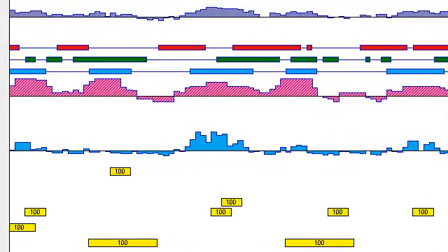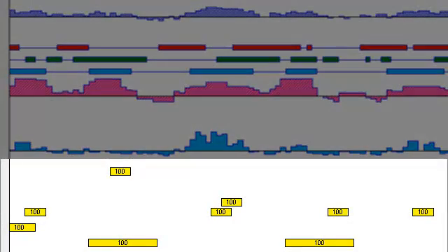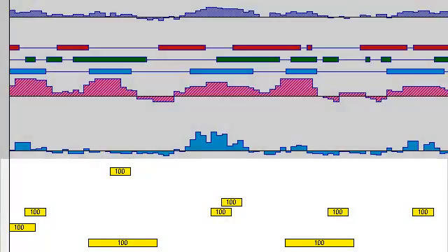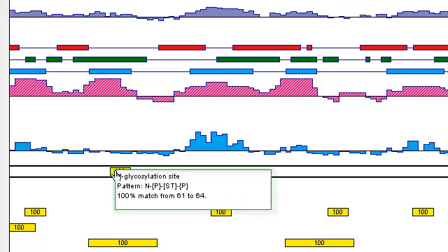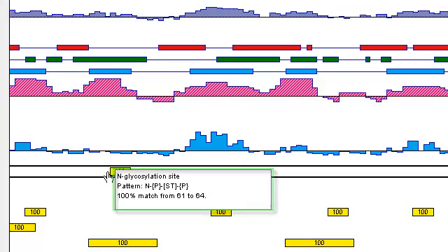You'll notice that there's a number displayed on each match, and this represents the match percentage. Clicking and holding on a match will display additional details, such as the name of the site, the pattern, and the range of sequence matching the pattern.